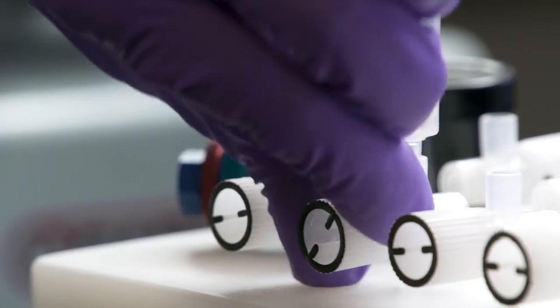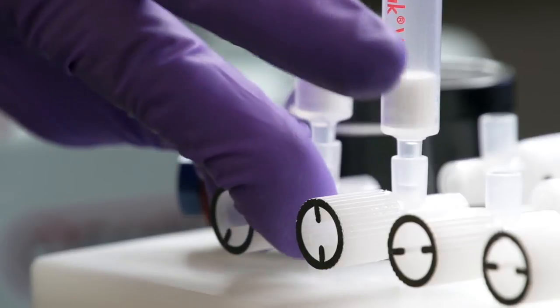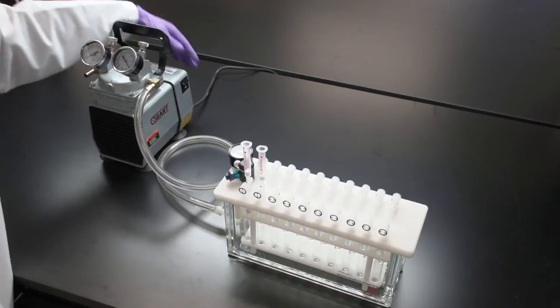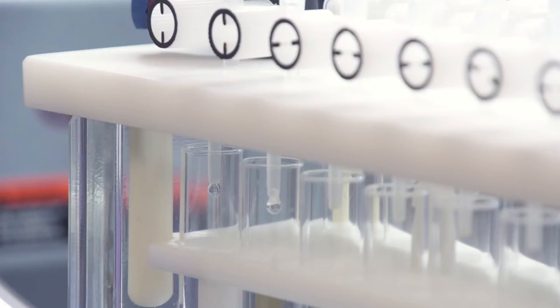Set the regulated vacuum source to zero and turn the stopcocks to the open position. Gradually increase vacuum until you see approximately one droplet per second coming through the cartridges.